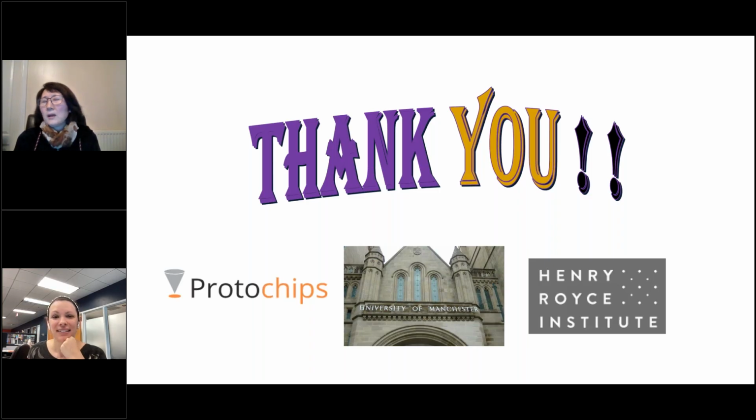It's possible. And I've tried, and sometimes it doesn't really want to go where you want. It doesn't really listen to you. It just does whatever it wants to do. It just places somewhere else. I tried, in the very early days, to use the ion beam to just mill it off, but actually it doesn't work. So basically it's just a few tries to put it down. If it goes back, you just put it down again.